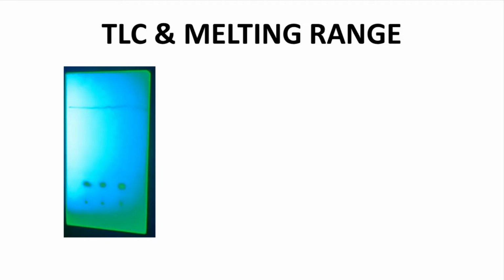Here is the TLC of the isolated product. This TLC was eluted with a mobile phase of 10% ethyl acetate, 90% hexane. The Rf of this main spot is 0.21. This looks like just one spot, but there is a bit of a shadow down at the bottom of the plate. This crude product seems fairly clean, but it may not have a very high purity.